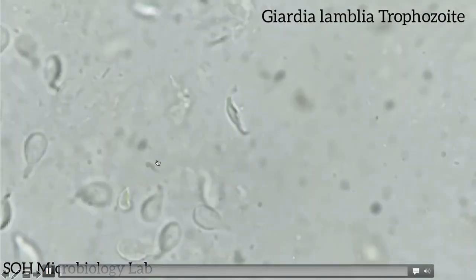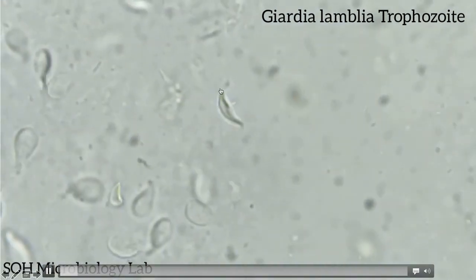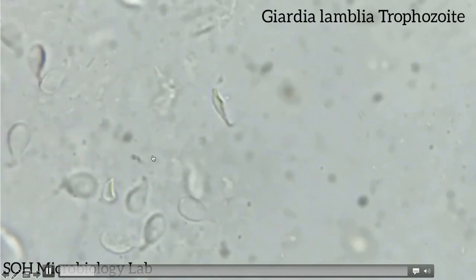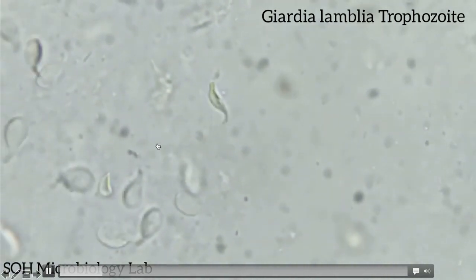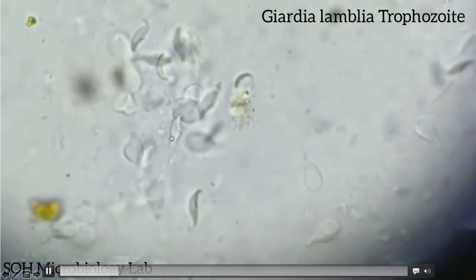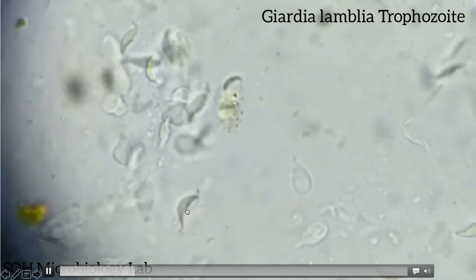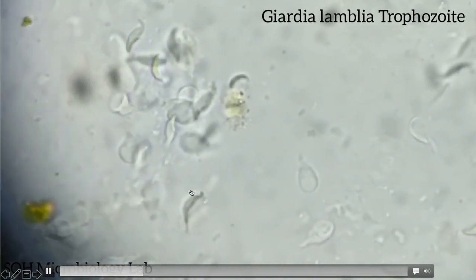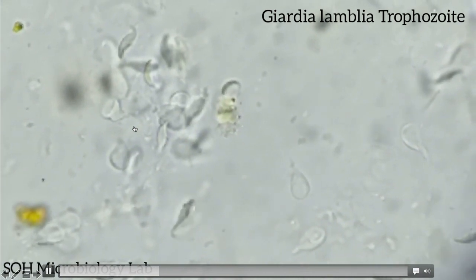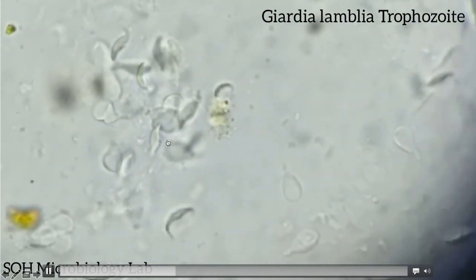Here is the view under the microscope. As you can see, the movements of the Giardia. Okay, this is the flagella, this is the Giardia. Okay, شوفون الحركة يا طلاب، شوف حركة كحركة تساقط الأوراق. This looks like a dead leaf fallen movement. زين، هاي حركة التروفوزويتس، هذه under the microscope.